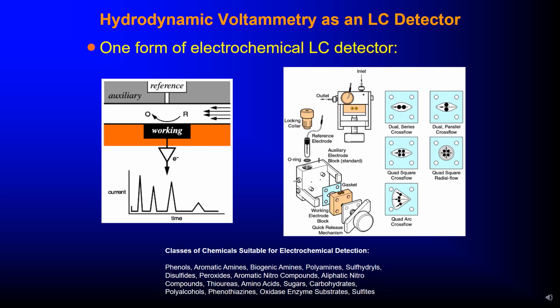So hydrodynamic voltammetry as an LC detector. Of course you know what we mean here, so it can be used as a detector.